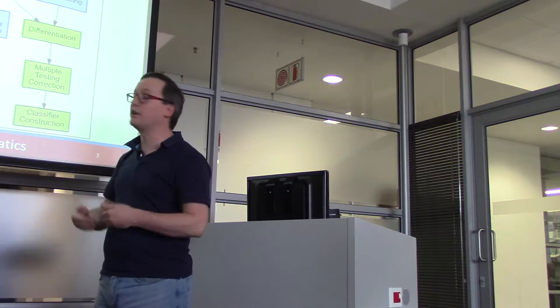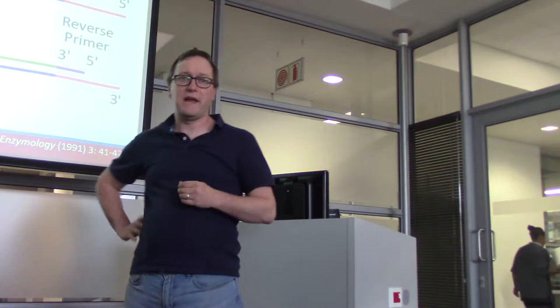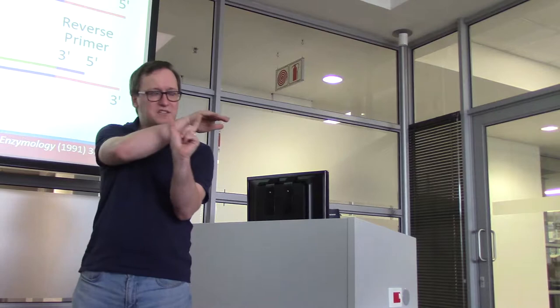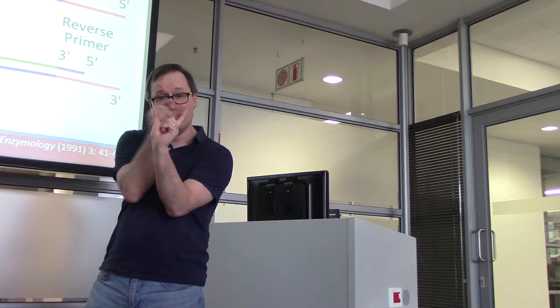All right. So let's start with paired end sequencing. This is what I consider to be one of the most important concepts in understanding how assembly works. But I frequently find that people don't really understand what it does. So I think it's really valuable if we can spend a little moment with that. Let's start with the fact that sequencing doesn't start with one long contiguous sequence. Typically, when we're running a sequencing reaction, we're focused on little short segments of sequence, maybe up to 10,000 nucleotides in length, something like that. And we're not going to sequence the entirety of these 10,000 nucleotide stretches. Instead, we're going to sequence a patch at this end, and we're sequencing another patch at the other end.